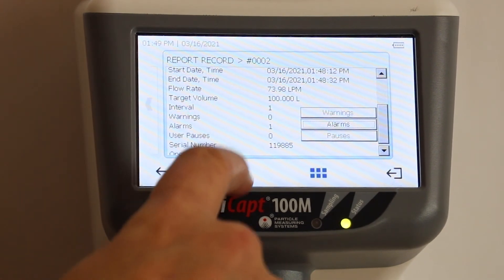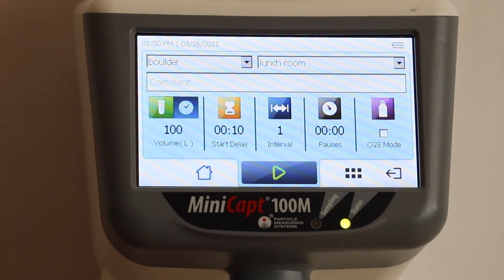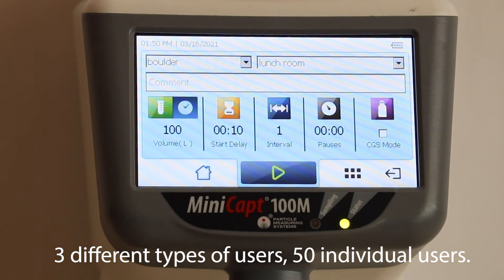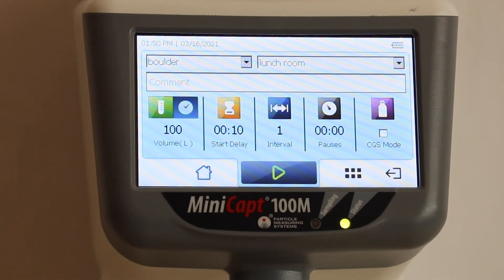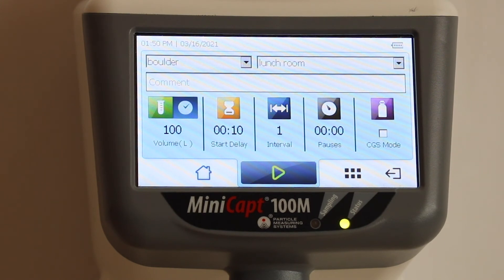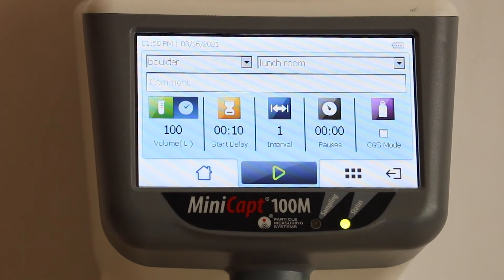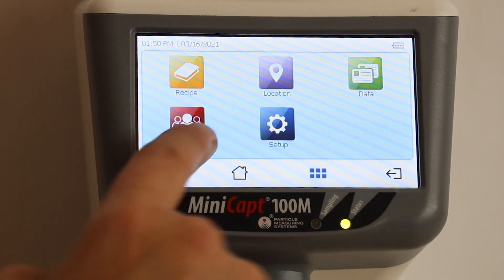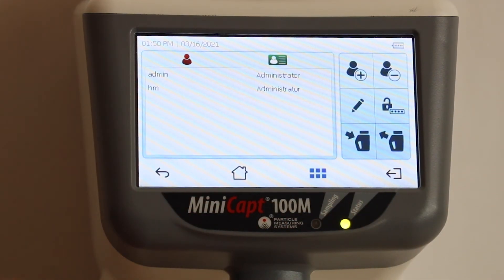There are three different user types you can set up in the instrument: administrator, supervisor, and operator. The administrator has full control over everything. The supervisor has limited power — they can set up recipes and locations but cannot change passwords or create users. An operator can only perform basic functions: choosing a pre-created recipe and starting the instrument.